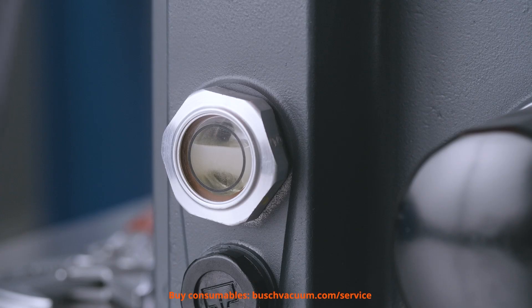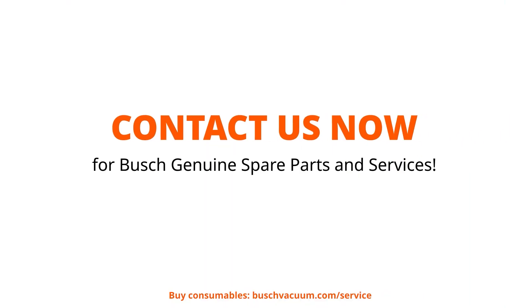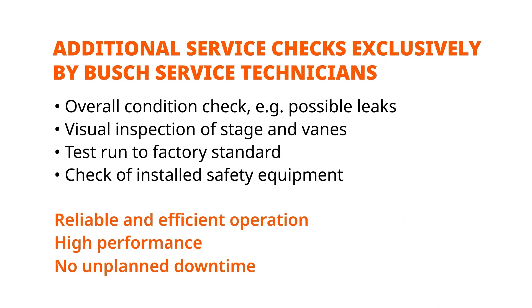Now we can adjust the oil level. Get your Busch genuine oil, oil filters, and oil drain valve kit now — everything you need for an easy oil change and long lifetime of your vacuum pump. Contact us via buschvacuum.com. Or let us do the whole maintenance. Why wait? Get a quote now for our Busch quality service.